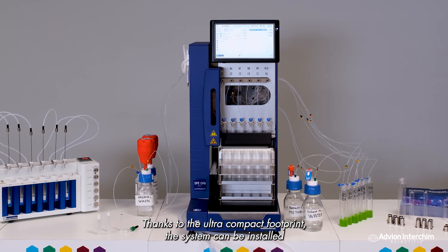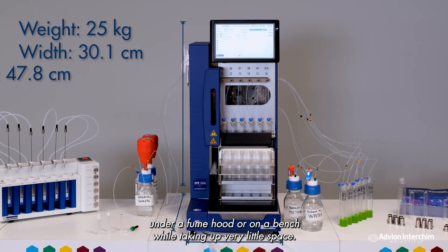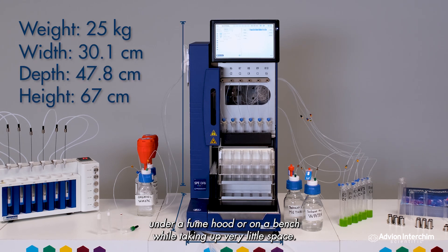Thanks to the ultra compact footprint, the system can be installed under a fume hood or on a bench while taking up very little space.